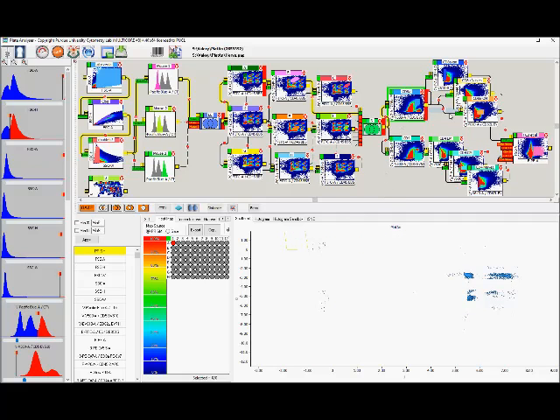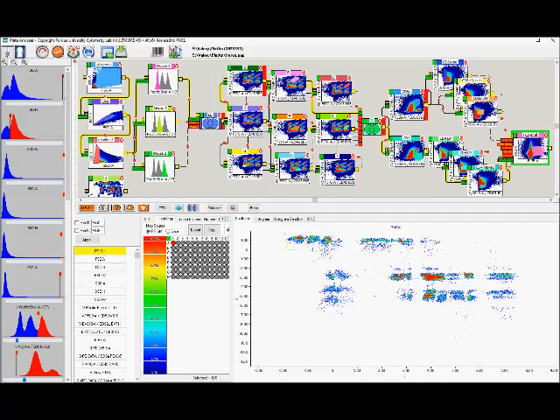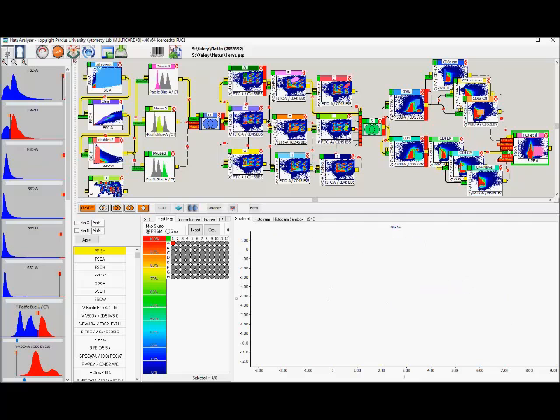And now I can go over here and select this population, and I can walk through here and find out what's going on with all of these. The reason this has changed, by the way, is because this one is not modal. If I make this modal, these will disappear. So now we can see the difference between the CD4 and the CD8s. They're in completely different locations. So that's the first thing that we can do with this.